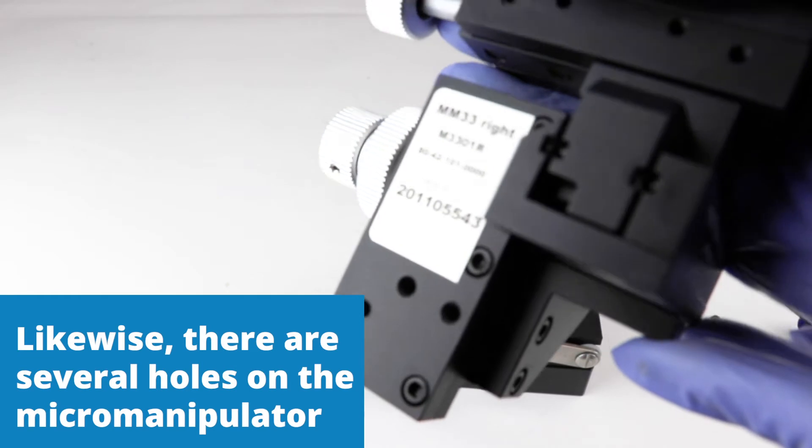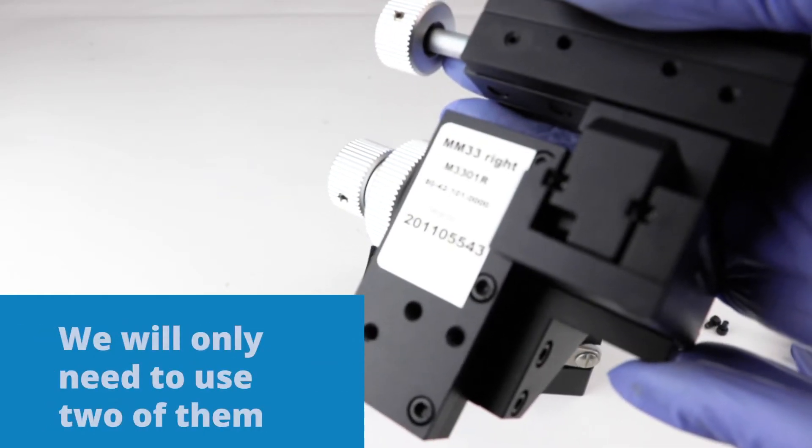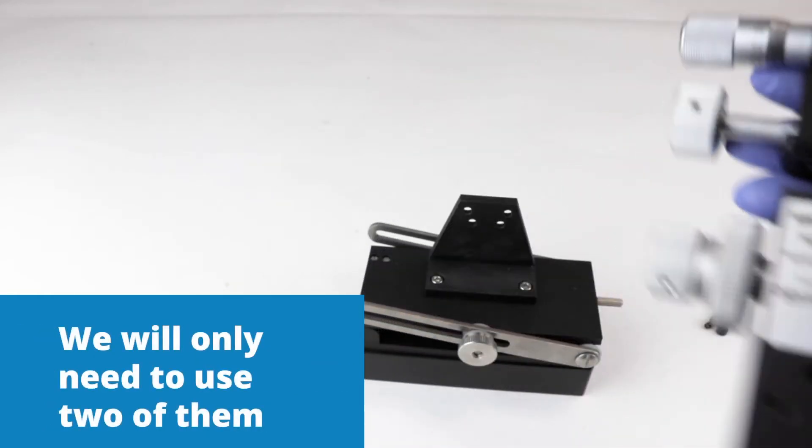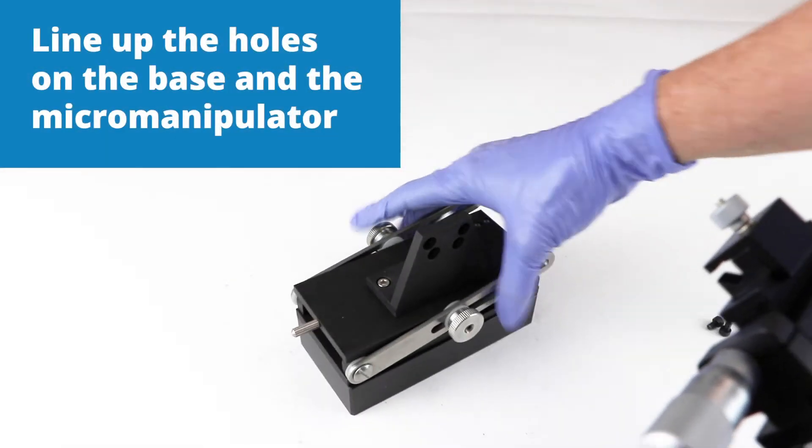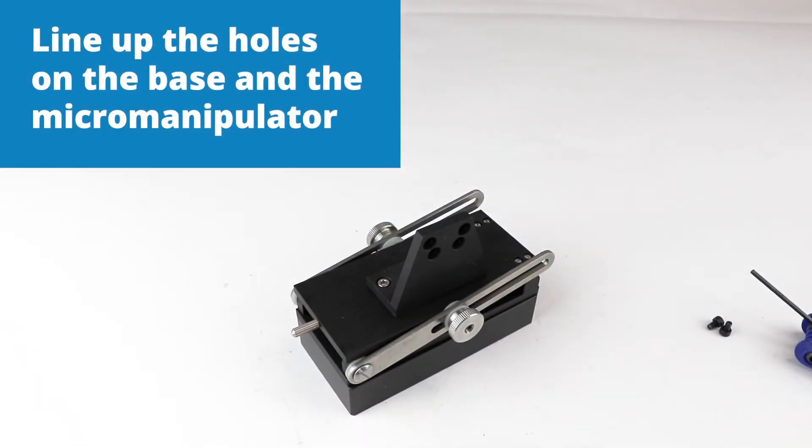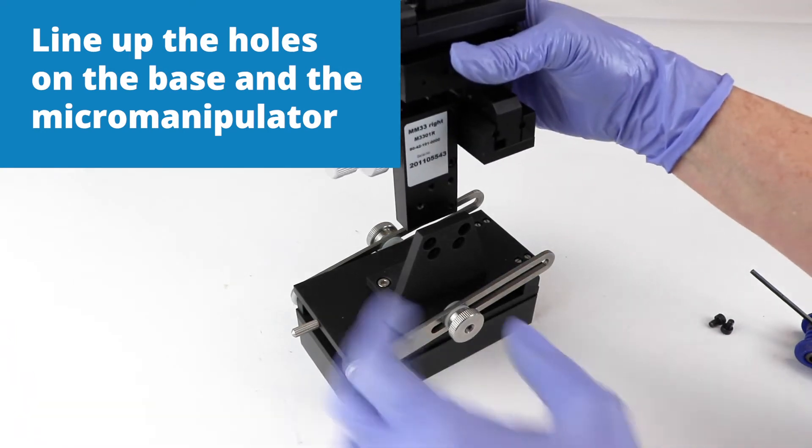Likewise, you have several holes in the bottom of the micromanipulator, and we're only going to use two of them. What we need to do here is line up the holes on the micromanipulator with the holes in the base.